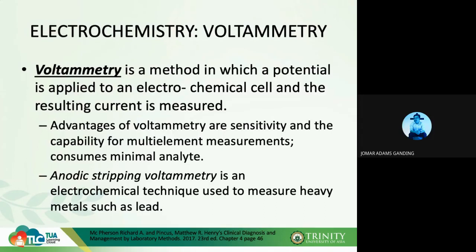This one, your voltammetry, is very sensitive and can measure multi-elements. Okay? Can do multi-element measurement. And aside from that, it also consumes only a minimal amount of analyte. So, konting sample lang daw ang kanyang kinoconsume. Okay? So, one example of voltammetry is used in the measurement of heavy metals such as your lead, which is your anodic stripping voltammetry.